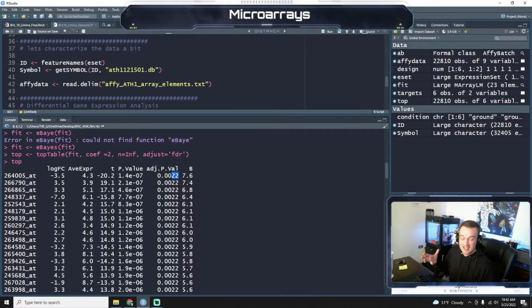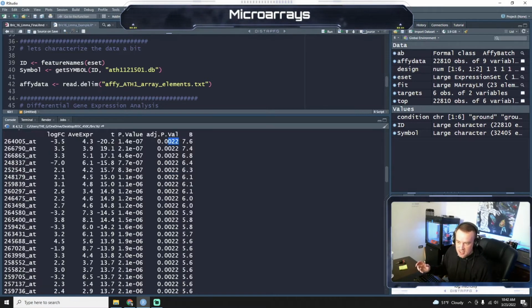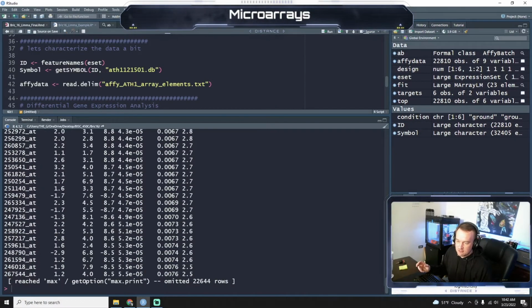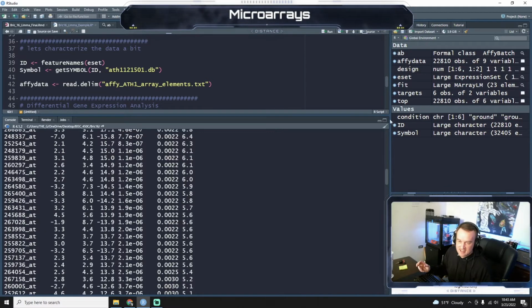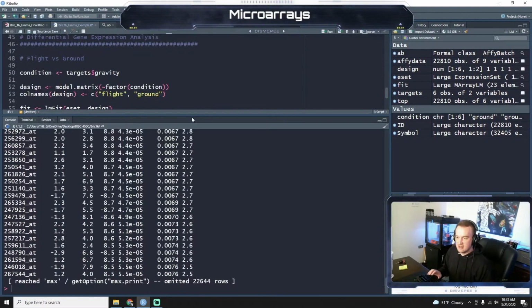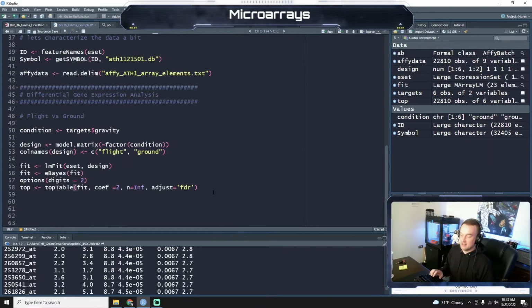So we still use the idea of 0.05 here, but just in the sense of a multiple test correction. So if we were to go, we have a lot of significant ones. Eventually we'd get to some that say they're significant with the normal p-value, but after the test correction are not significant anymore. So those we just, for the sake of good science, ignore.